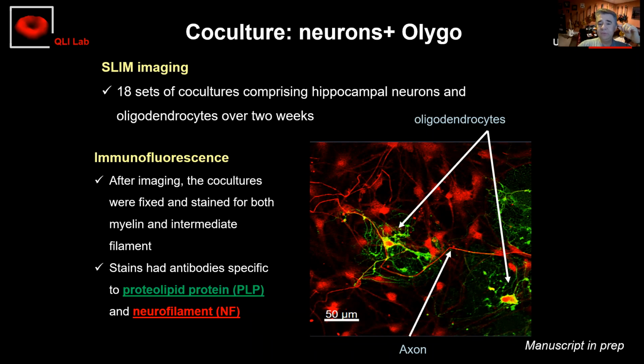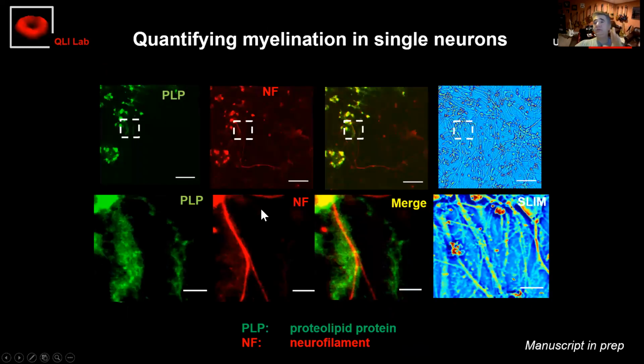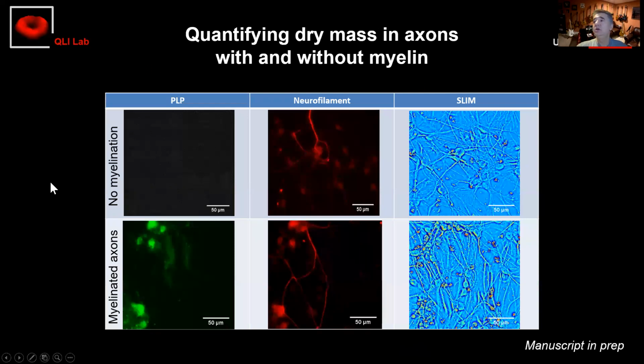fat. So we're looking at very, very tiny things, but encouraged by the nanoscale sensitivity, the microtubule I showed you earlier, we were really encouraged. We also needed some ground truth. So we worked with collaborators to generate these fluorescence tags. So basically we confirm that what we're looking at is myelin and not something else.